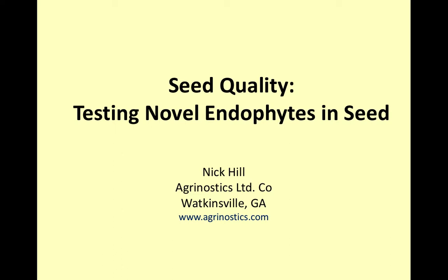So I'm going to talk to you today about seed quality and the testing that gets done on these novel endophyte products to provide assurances that when you buy this seed at a value-added price, that you're actually getting what you expect to get when you purchase that seed.